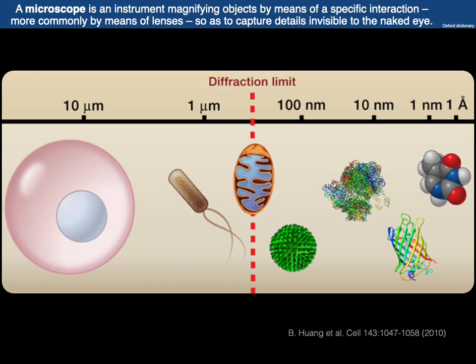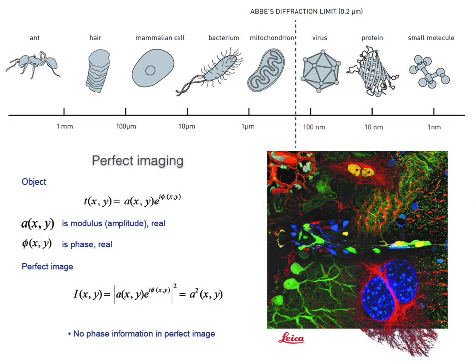Yes, the nanoworld. The world we are interested in with our microscope. The biological world that moves from organs and tissues to cells, 10 microns, down to 1 micron for organelles and other aggregation of molecules, and then down to protein and DNA, down to the 1 nanometer. But now, the point is that not only are these kinds of objects small, but in some way they are also transparent. I mean, in case your molecules were able to absorb light from the sun, you would burn.